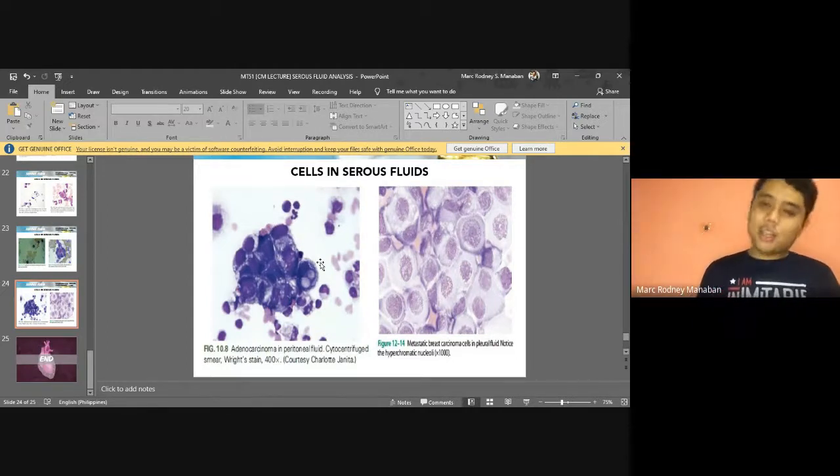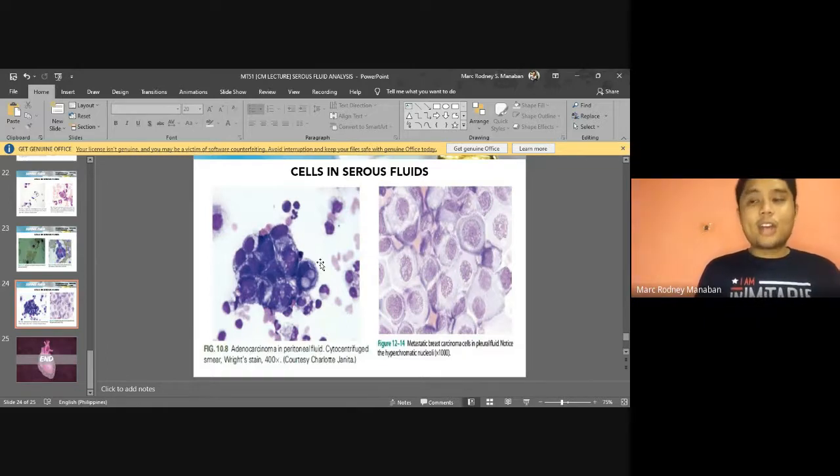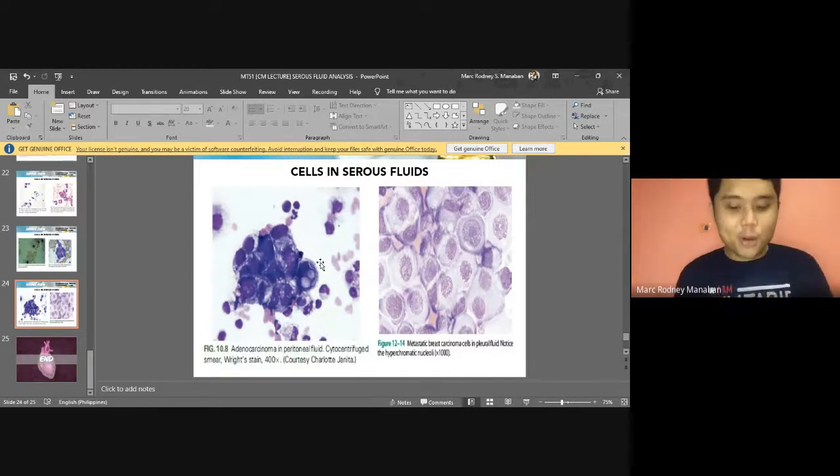So that's why I'm telling you, be careful. Make sure of the unit, microbiology first, and then inform the medtech there which is for cell count and which is for cell block, then transfer or return to the section. For cell block, it needs formalin, and once formalin is added, you can no longer recover bacteria.